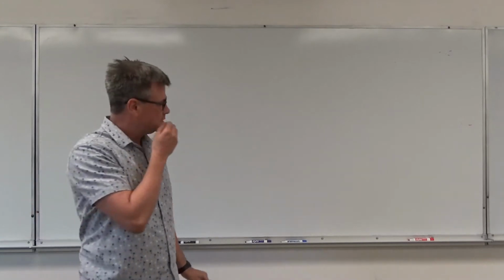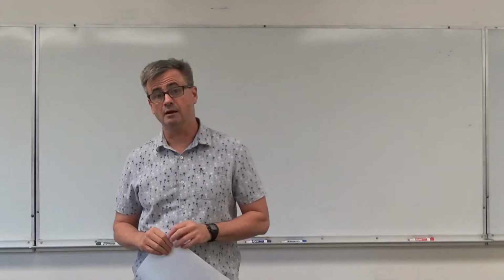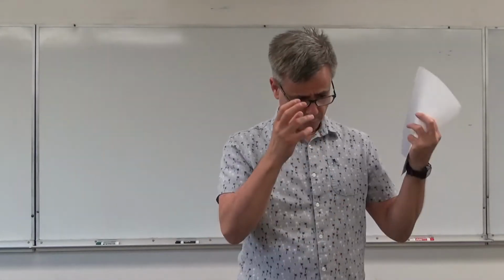The general idea for initial rates to figure out those exponents is that you run reactions with certain concentrations of, say, A and B, and see what the rate is. Let's just take for granted right now that you have some way of monitoring the rate.